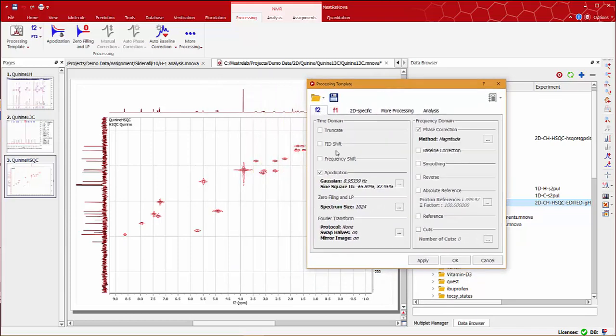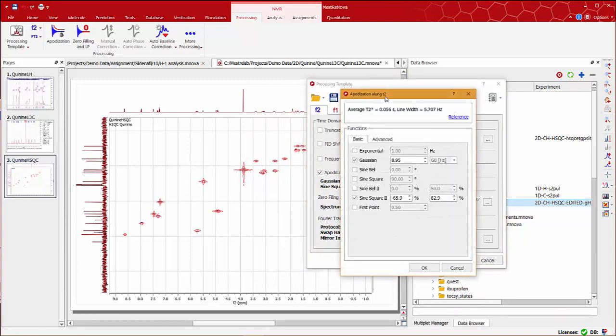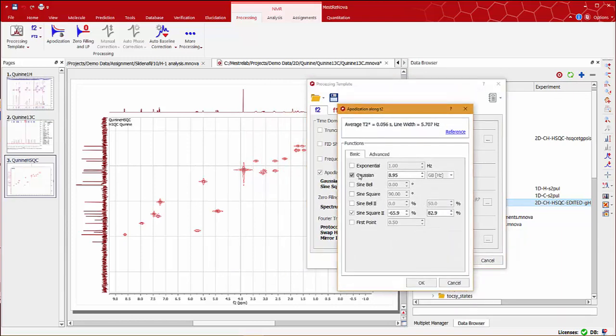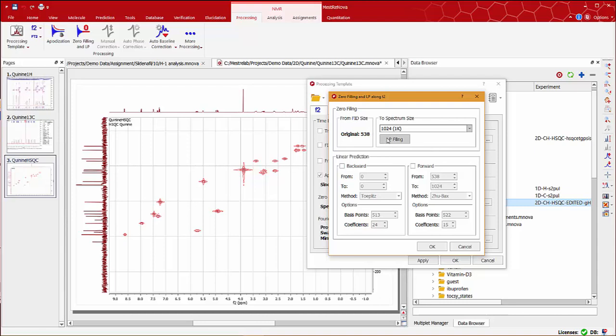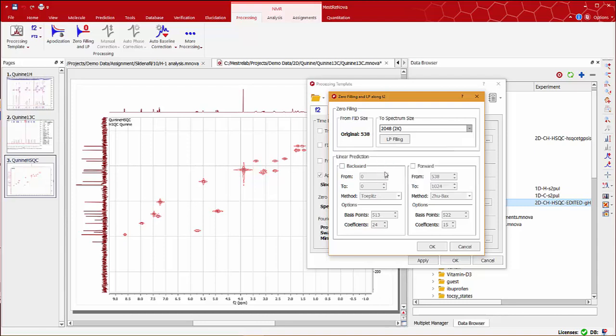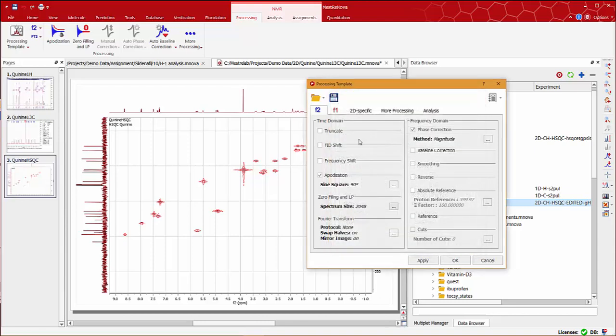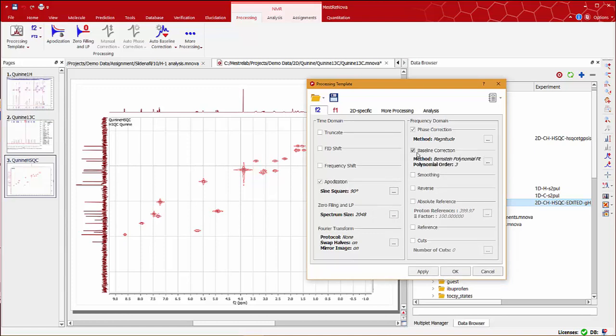On the F2 dimension, I'm going to change the apodisation along T2. From the available functions, let's select sin290 degrees. We can also click on the zero filling and linear prediction section and change the number of data points to 2k. Finally, I'm going to apply baseline correction using our default method, Bernstein polynomial fit with polynomial order number 3.